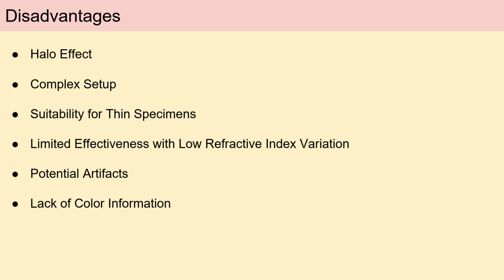Another limitation is that phase contrast microscopy is best suited for thin specimens. Thick specimens can cause multiple phase shifts and scattering of light, resulting in poor image quality and reduced contrast. Furthermore, the technique is less effective for specimens with little variation in refractive index, as it relies on these differences to create contrast. In some cases, phase contrast microscopy may also introduce artifacts due to the interactions of light with the phase plate, potentially leading to misinterpretation of the specimen's features.